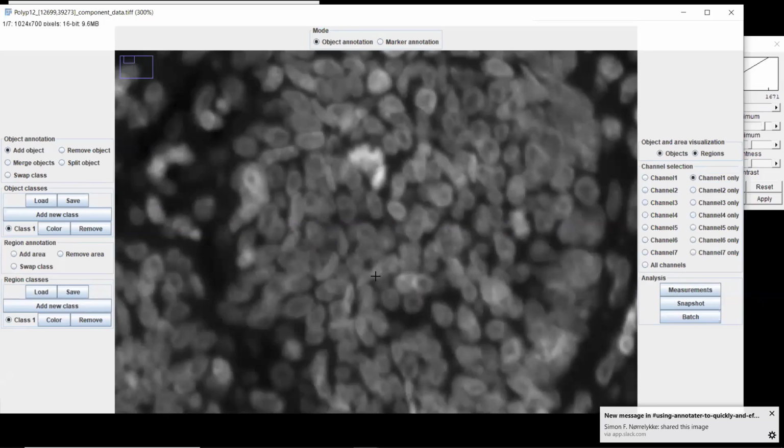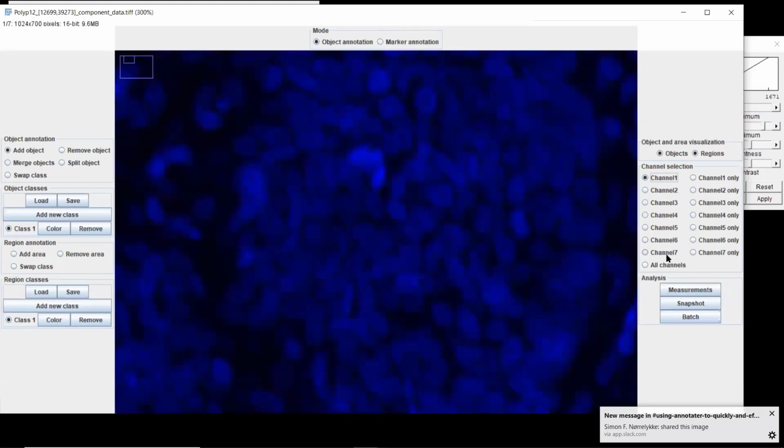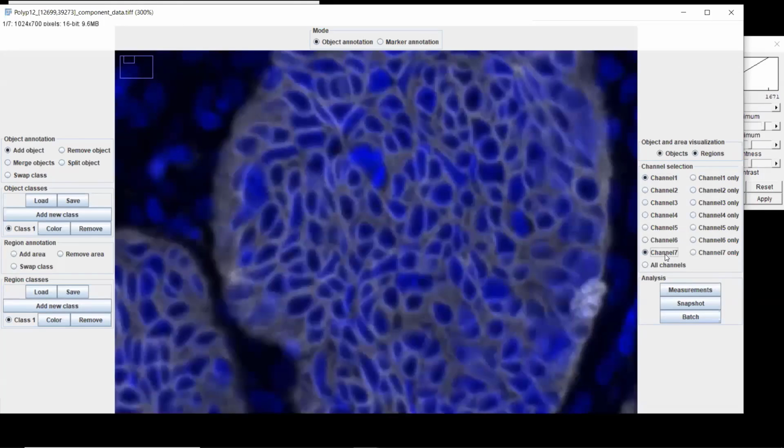Like in here, it's very difficult to know where your nuclei are. It's very packed. So sometimes it's easier to look at cytokeratin at the same time, where you have cytoplasm between the nuclei, and it helps you to differentiate the different nuclei.